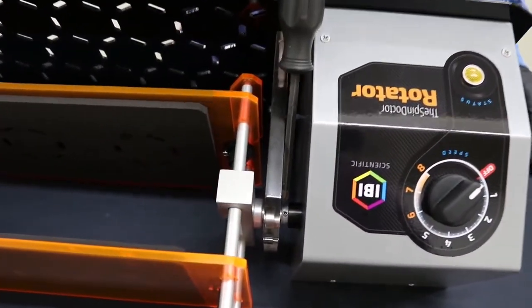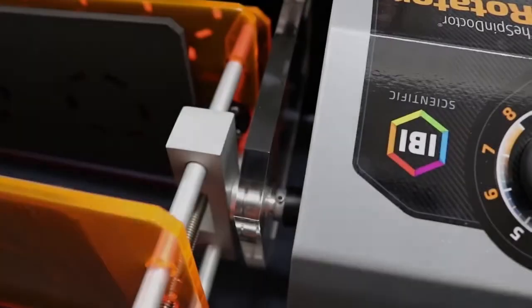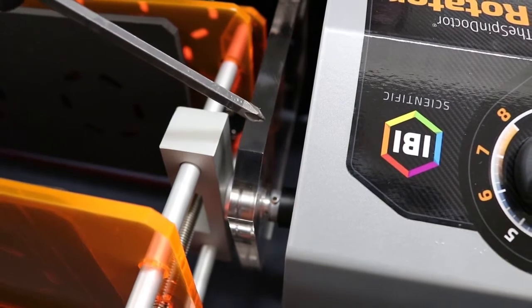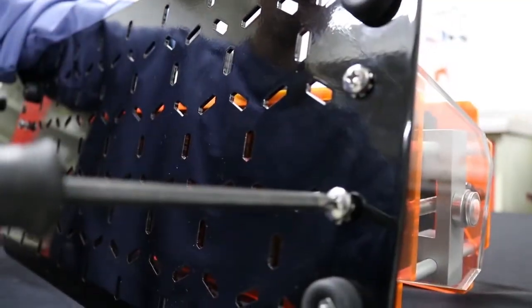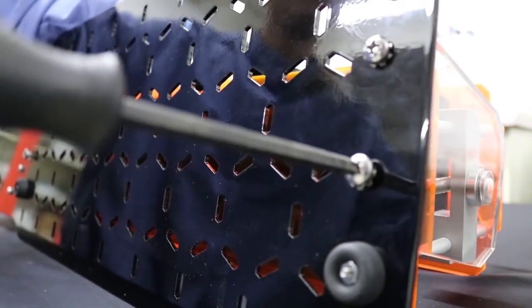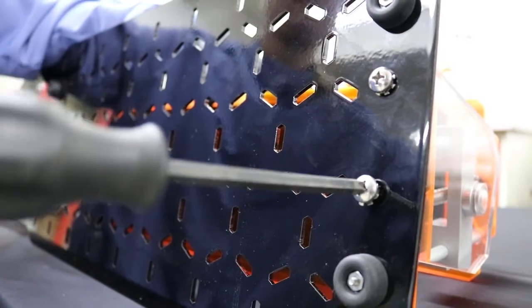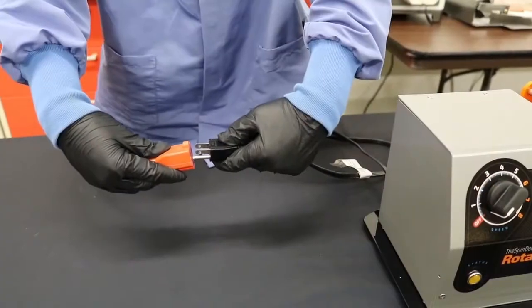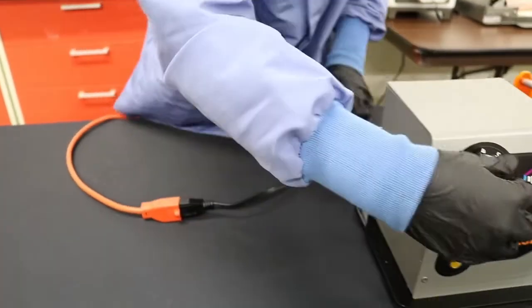Prior to tightening, double check the motor to platform coupling. Ensure the rubber coupling is secured to both the motor shaft and the platform assembly shaft. Finally, apply soft pressure to the platform assembly towards the gray control base and use a Phillips screwdriver to tighten all 4 screws. Now your Spin Dr. is ready to be plugged in and ready to use.